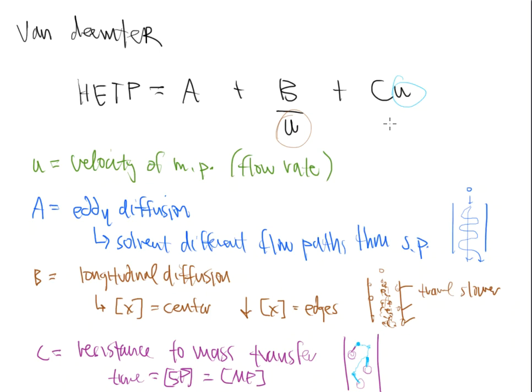All right, so we need to talk about what all of this basically means as far as an equation goes. Well, the Van Deemter equation gets a graphical representation. And basically what this graph looks like is that down here on the x-axis, it seems like everything is associated with velocity or speed, right? So I'm going to put velocity here on the x-axis.